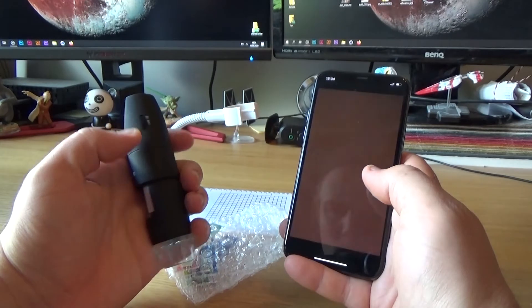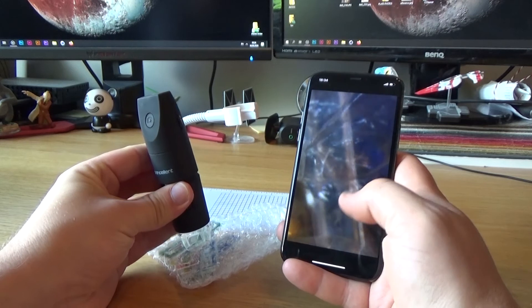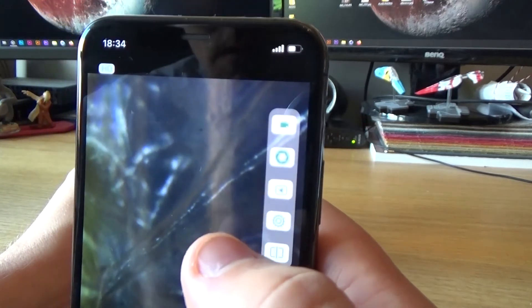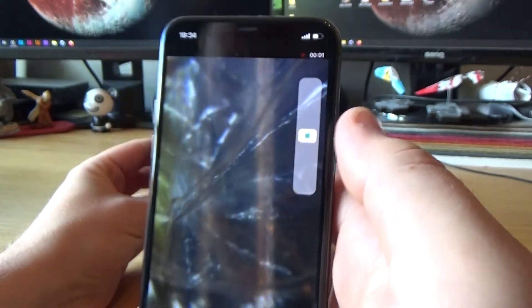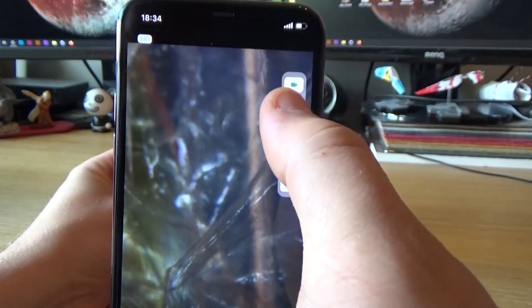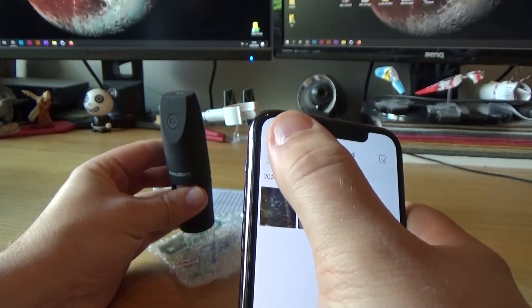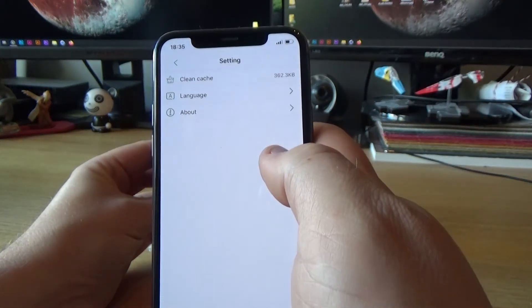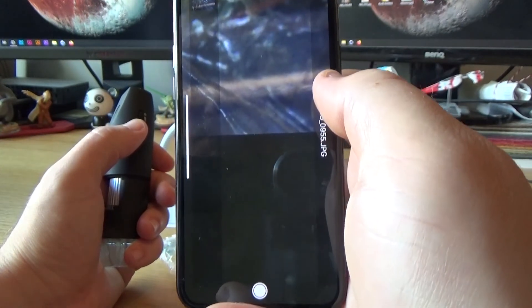There is a USB-only version of this microscope available — it costs about five or six bucks less. But I think the Wi-Fi version is absolutely worth it. If you're into this kind of stuff and you like hiking and walking around and you have kids, get the Wi-Fi version. It works reliably, it's smooth, it's great. You can do all the things you could do on PC: record video, shoot photos, change the settings. There aren't many settings you can change, which is not great, but it's enough to have fun with. I would definitely recommend this product for you to explore and have fun with.